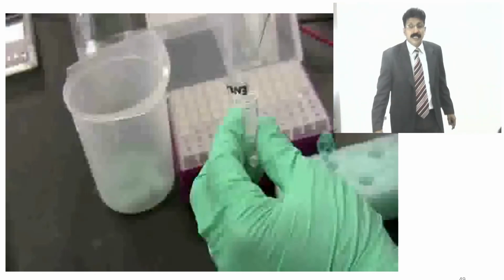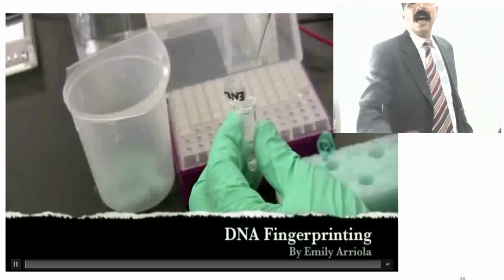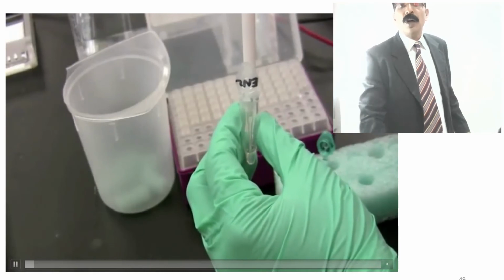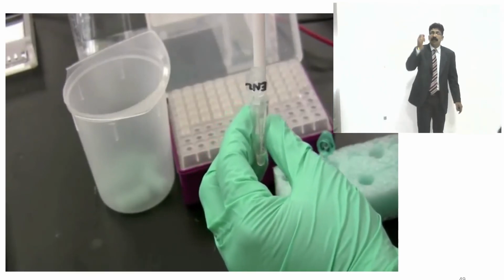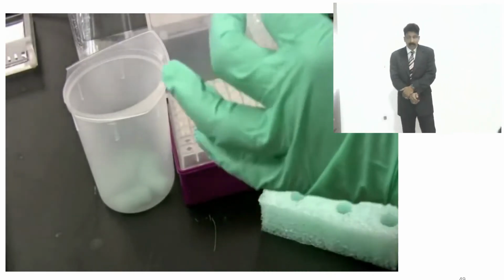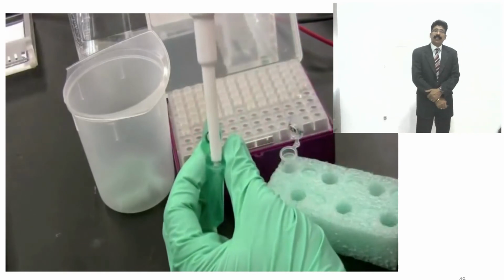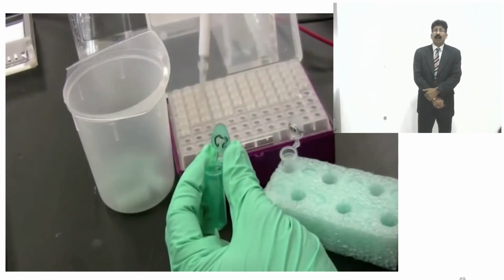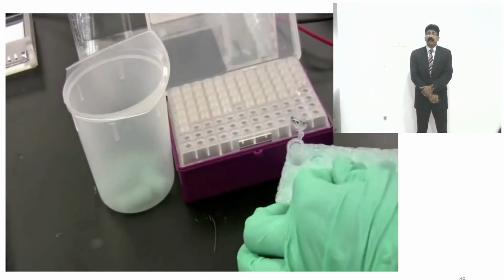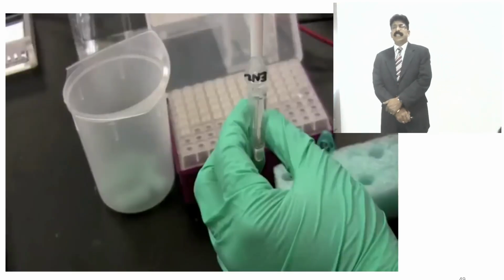When you see this video, we will understand how they prepare the agarose and make the gel, very clearly. See here, restriction enzymes. Let me show how they use the enzymes in the sample tube, adding the enzymes so that the breakdown of the DNA takes place, as shown in the video. And now, just after breaking down, you see, she is adding the enzymes at the sample point, and then after the breakdown, we keep it ready.